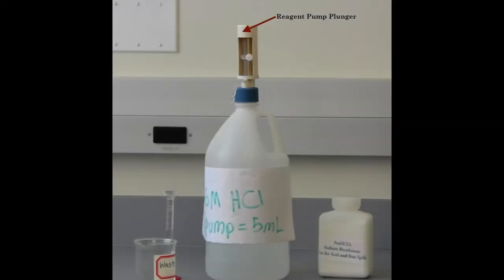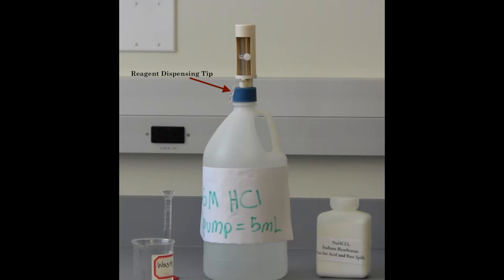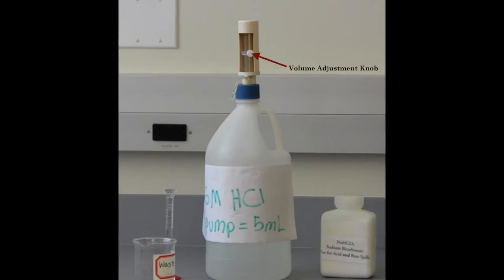Now let us examine the reagent pump. The pump itself has a few components: a plunger to lift and release for reagent flow, a plastic tip for precise allocation of reagent, and a volume adjustment knob. Do not touch the volume adjustment knob. This knob has been set prior to the lab.